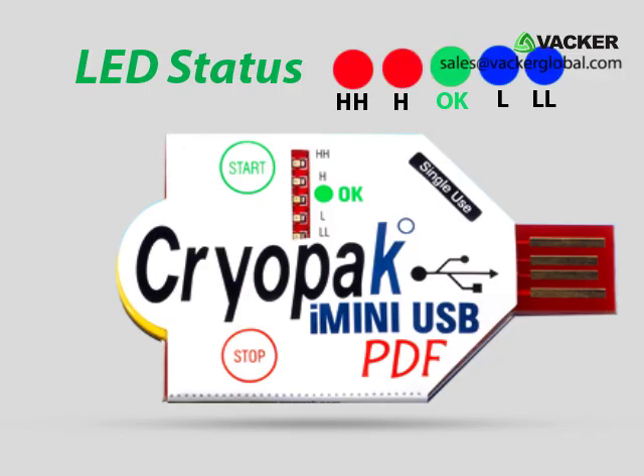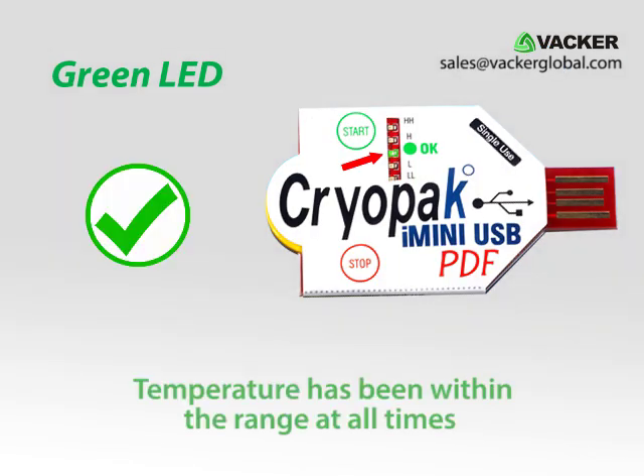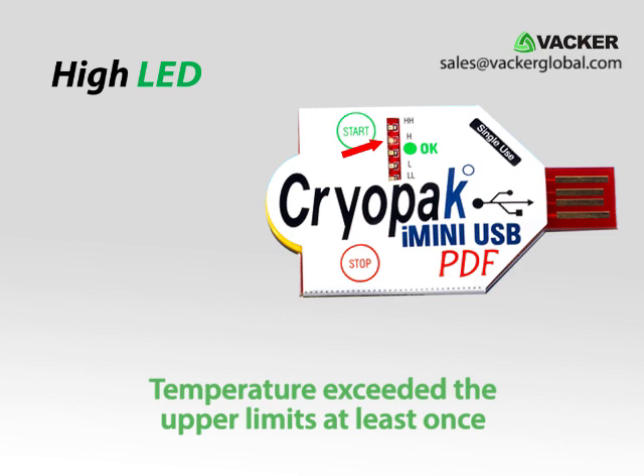At the end of the transportation the customer checks the status of the LED. If the green LED blinks it shows that the temperature has been within the range at all times. If the red LED is blinking it means that the temperature exceeded the upper limits at least once.